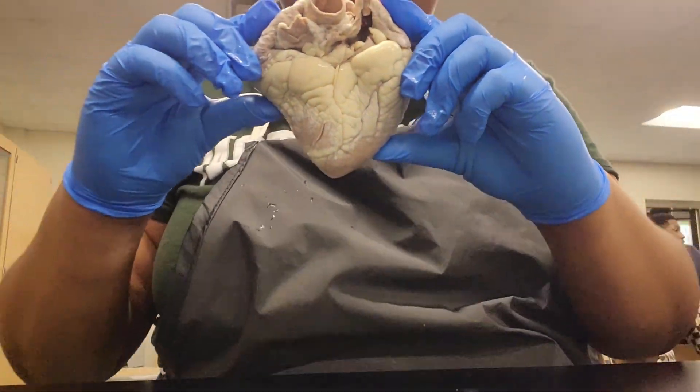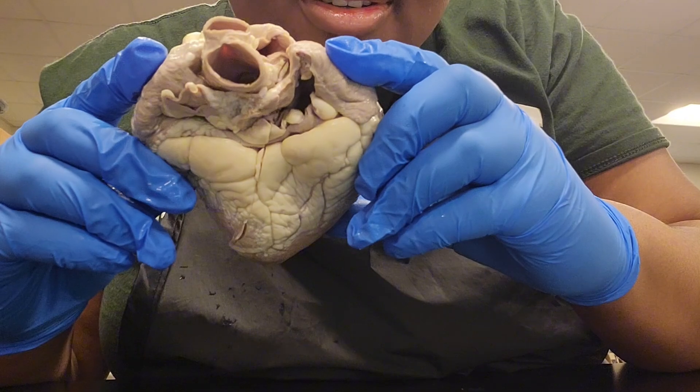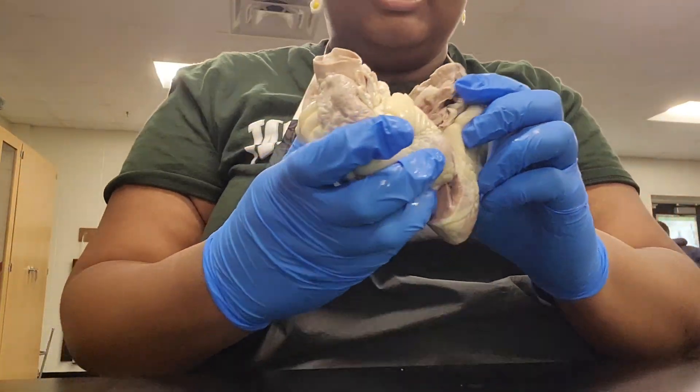Here is, I believe, the side of the heart, and we can see a good view of the aorta and some of the arteries, as well as the atrium.